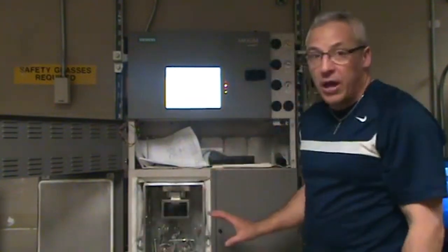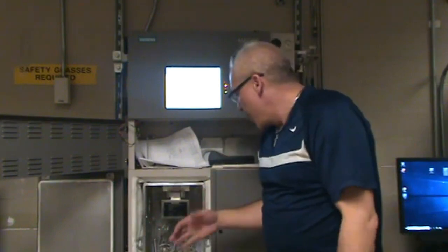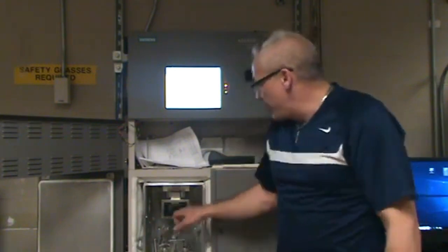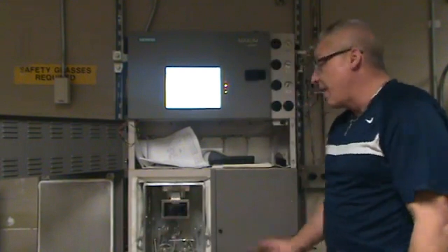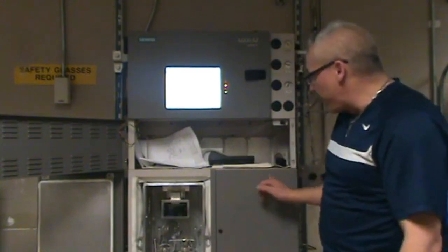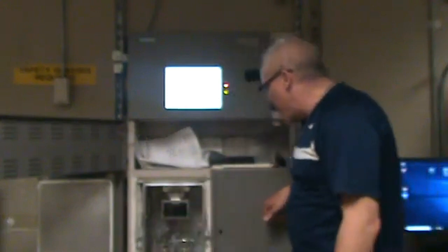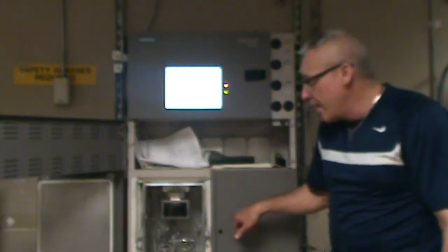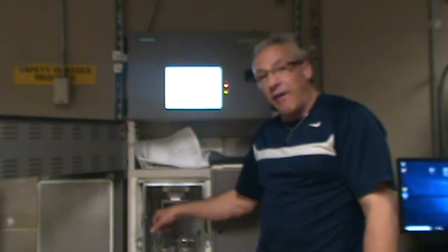We have two apps. We have app 1, app 2, and they're identical. And basically on these two apps, it's still two independent GCs in those apps. So this is your right side, this is your left side, makes very common sense. This is your side on this side, and this is your side on this side. So this is your furthest right. So the set of thermistor beads that's in this side is going to be the right. And then this set that's going to be over here is going to be the right-left. In this case, this is going to be left-right, and this is going to be left-left.